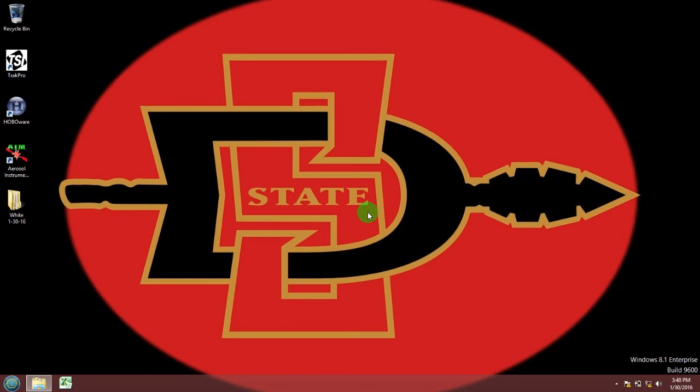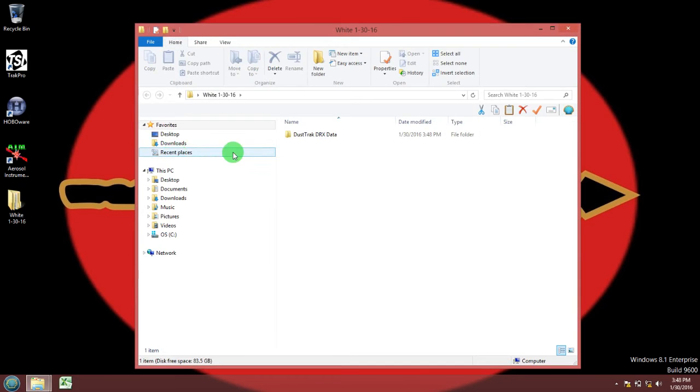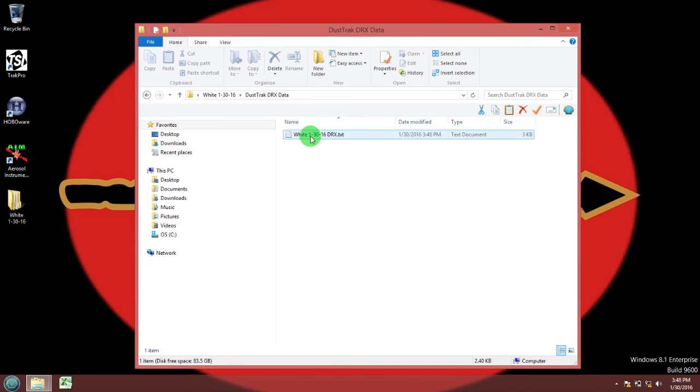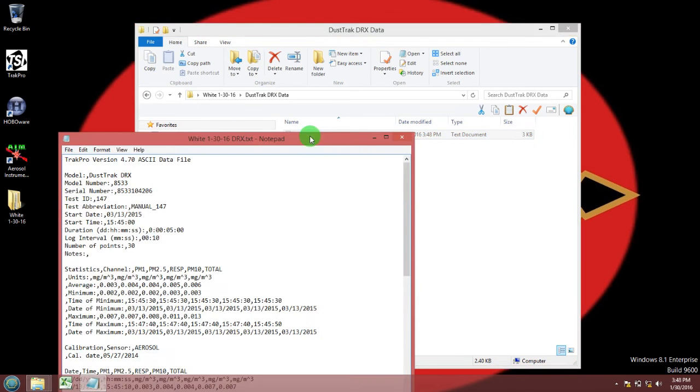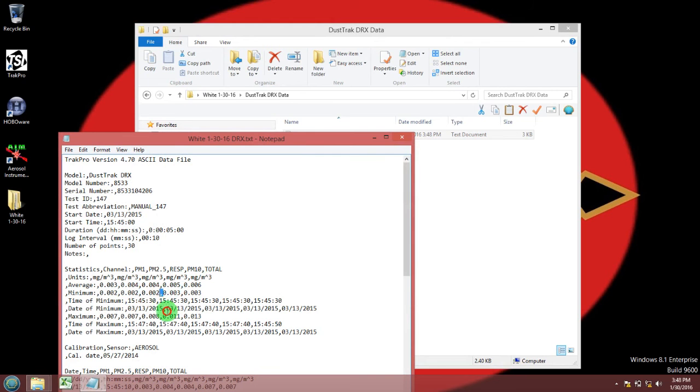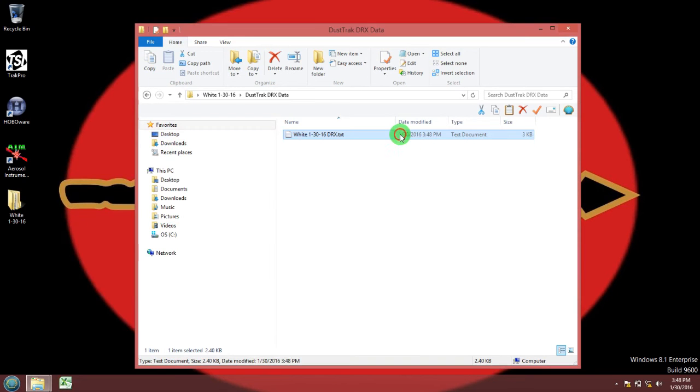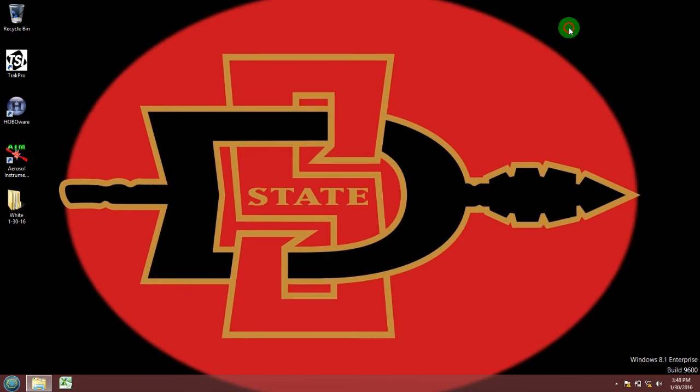Now go into your folder on the desktop, into the DustTrack DRX data folder, and you will see a text file. Go ahead and open that. This is all your raw data that you have from the DRX, but in order for Excel to understand it we are going to have to import it. You see all those commas, that's what's going to tell Excel how to differentiate your data.